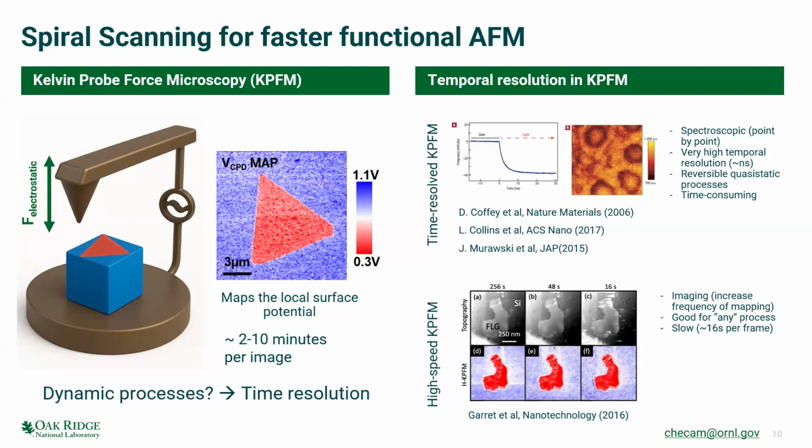Well, in BFO, you don't necessarily have this A1, A2, because in BFO you have some of the four diagonals, and you still see some sort of nice structure come out of it, but the switching mechanism is completely different because the nucleation is different for that material. So it's not necessary, but it plays an important role, I'd say.